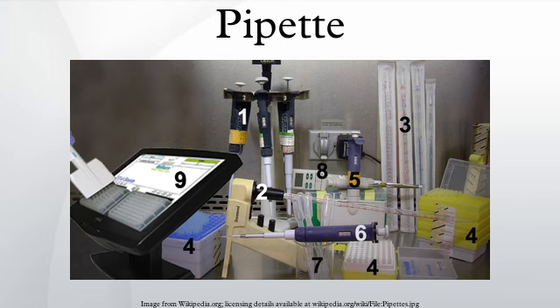History: the first micropipette was patented in 1960 by Dr. Hans Schmitz. The founder of the company Eppendorf, Dr. Heinrich Netheler, inherited the rights and started the commercial production of micropipettes within the 60s. The adjustable micropipette is a Wisconsin invention developed through interactions among several people, primarily inventor Warren Gilson and Henry Lardy, a professor of biochemistry at the University of Wisconsin-Madison.